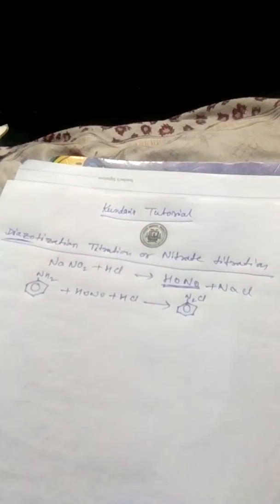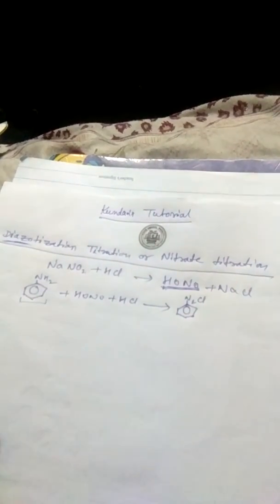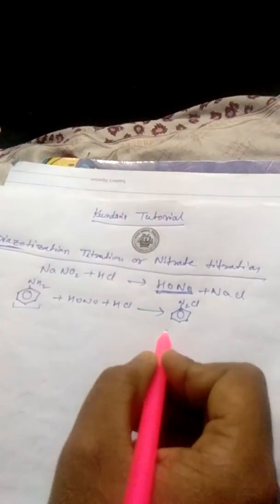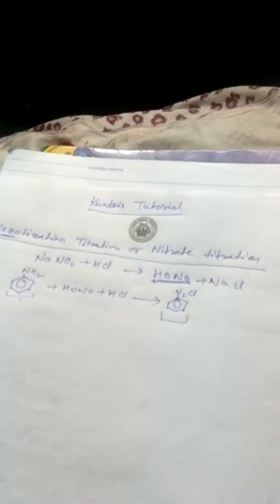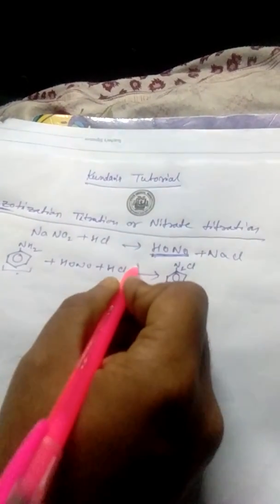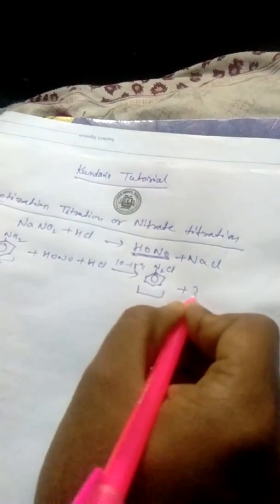nitrous acid, HONO, and NaCl. This mainly reacts with aromatic primary amine. It never reacts with any aliphatic primary amine because the salt formed with aliphatic amine will again degrade, because that one is highly unstable, and this salt is quite stable, but only at low temperature, about 10 to 15 degrees Celsius, and along with it will produce water molecule.